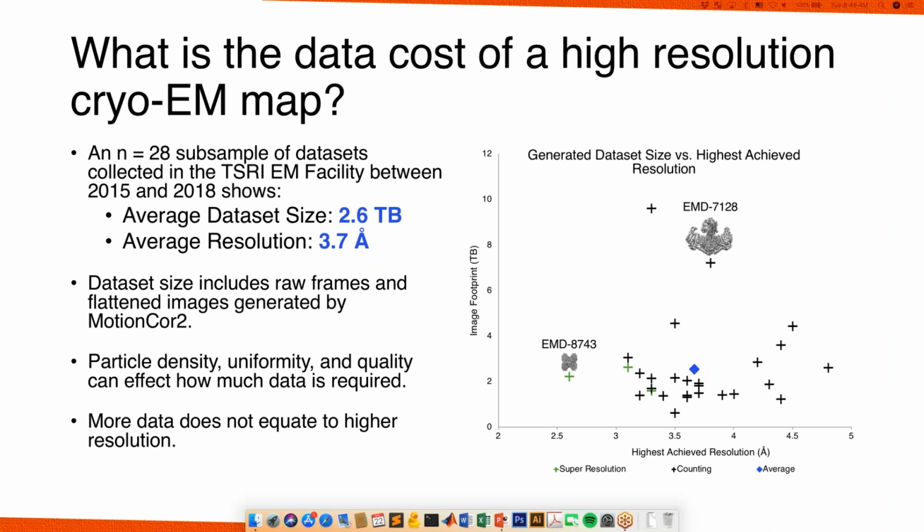While I'm going to report averages here, you should really always consider the maximum, I think. The takeaway here, though, is that more data doesn't always equal higher resolution.